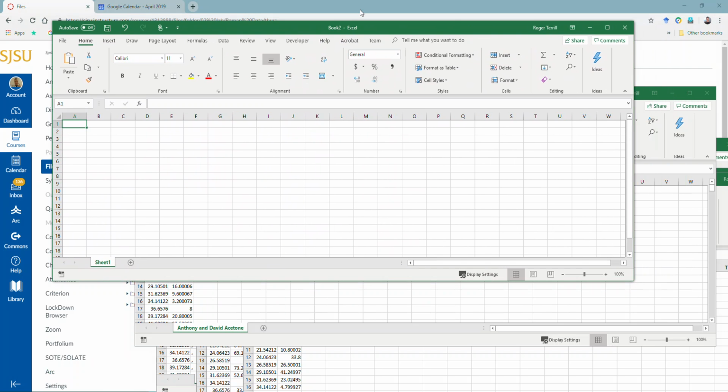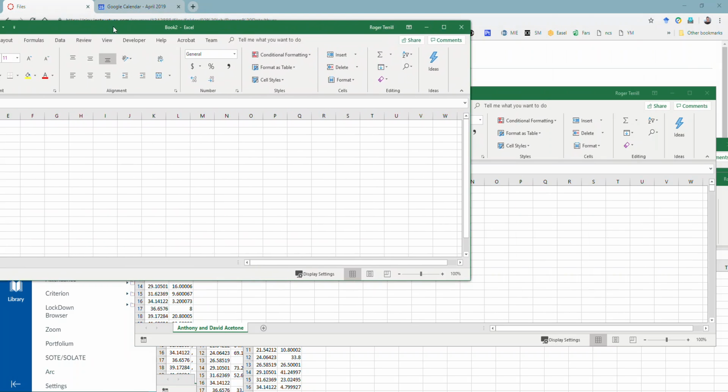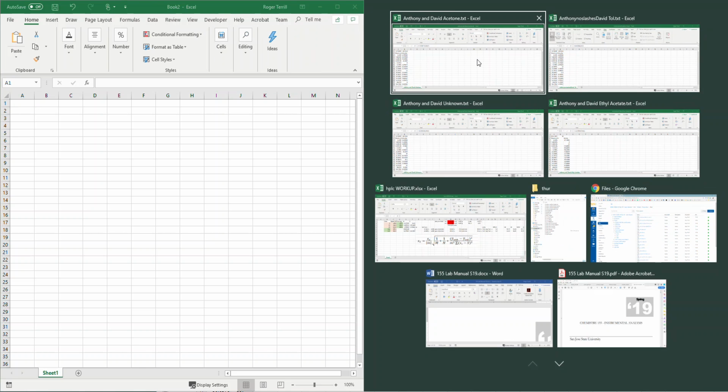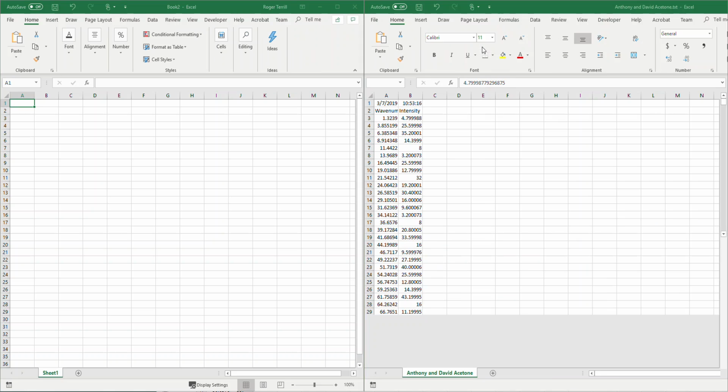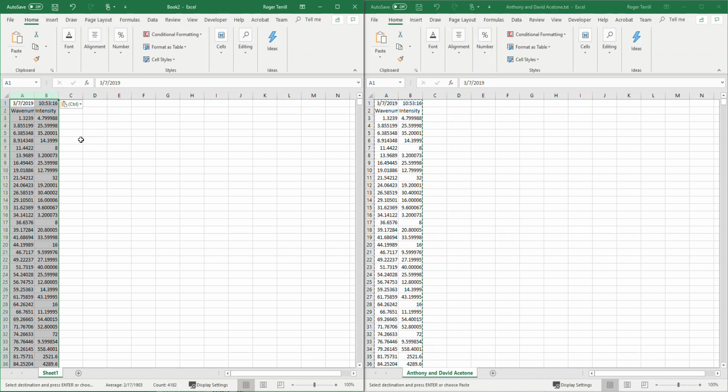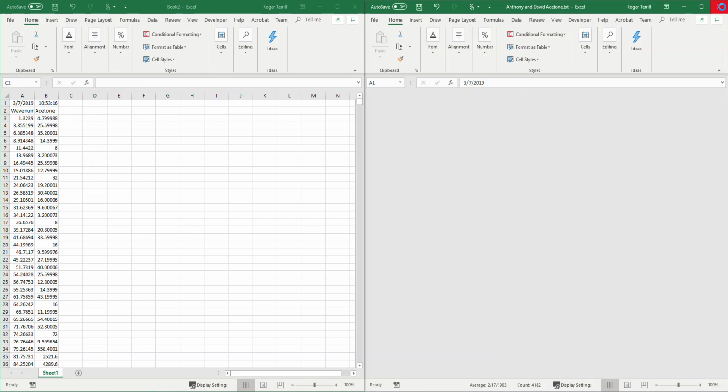So here I'm going to have all these folders, all these vendors flying around here. Oh goodness, what am I going to do here? Let me get these guys out of the way. Let's do acetone first, okay? Let's actually take both these columns from acetone and we'll put them here. Okay, this is stupid, I know. But there's acetone, right? So instead of intensity here, I'm going to write acetone, right? Now I'm going to take this one, I'm going to close it.